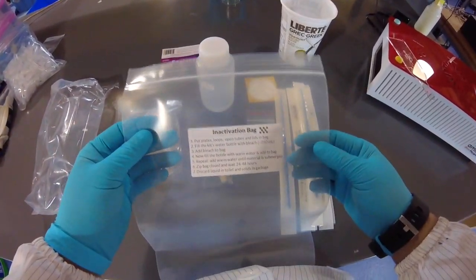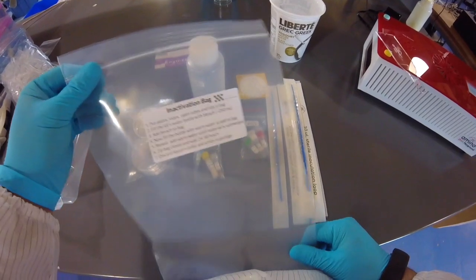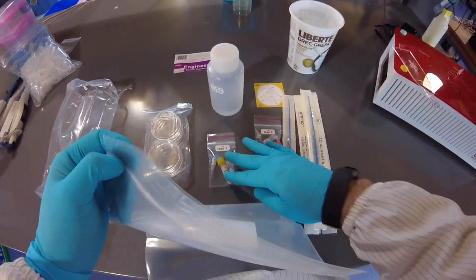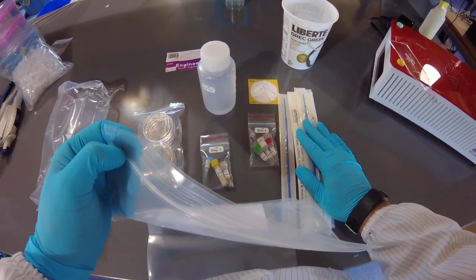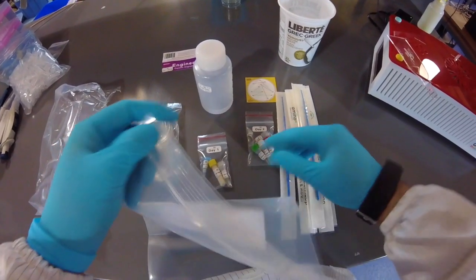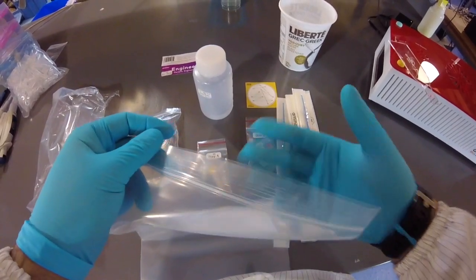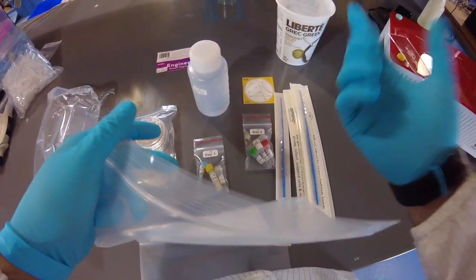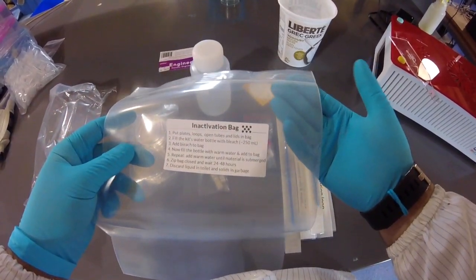This is called an Inactivation Bag. This is a bag that you're going to put all of your used tubes and loops in when you're done with them. You don't need to necessarily put your gloves in here unless you're pretty sure you got bacteria on them. Otherwise, these can typically go into the regular garbage.